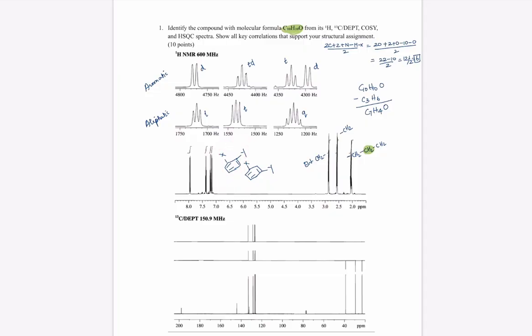Now what we are going to do is subtract the molecular formula of this di-substituted benzene from our original molecular formula, or from the remaining molecular formula. So the di-substituted benzene is going to be C6H4. So let's subtract C6H4 from whatever is left behind. That's going to leave us with a carbonyl group, a C double bond O.